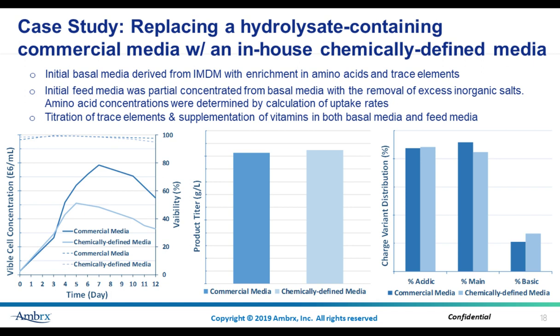The enhancement of specific productivity per cell is achieved by combining both optimization of the medium composition and the bioreactor operation conditions. PQ here on the right is very comparable. So those results tell us it's not unusual to see this kind of improvement, since you are the one who knows your cell line the most, not the vendor. If it's possible, you should develop your own medium. Of course, chemically defined medium is preferred.